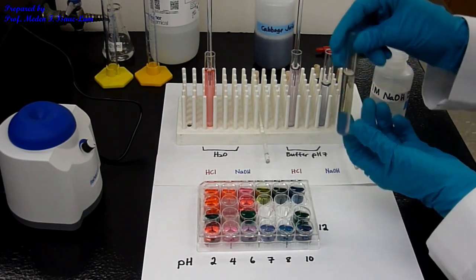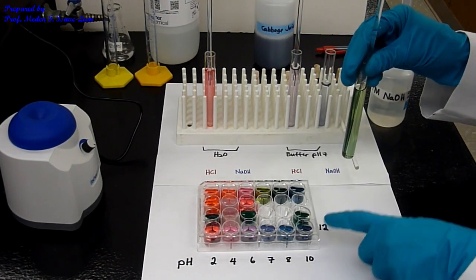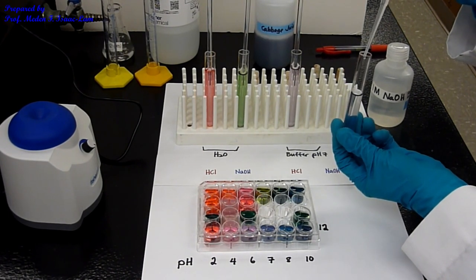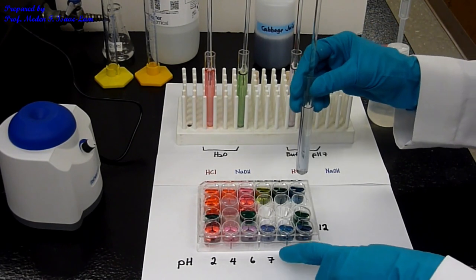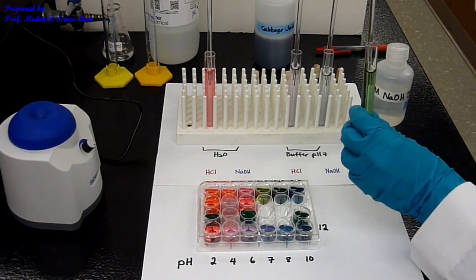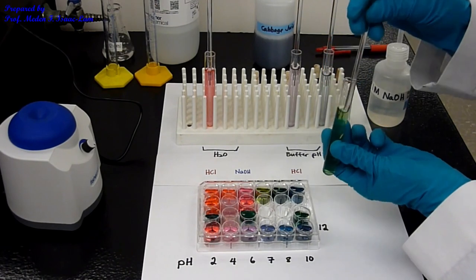Okay, so I'm going to use this. So now it's closer to 12. It's in between 10 and 12, so I would say approximately 11. Now I'm going to do the buffer, 1 drop. Buffer pH 7, so it's still around 7. I go back to the water. So now this is my drop number 2. Now it's more green. It's closer to 12 this time.